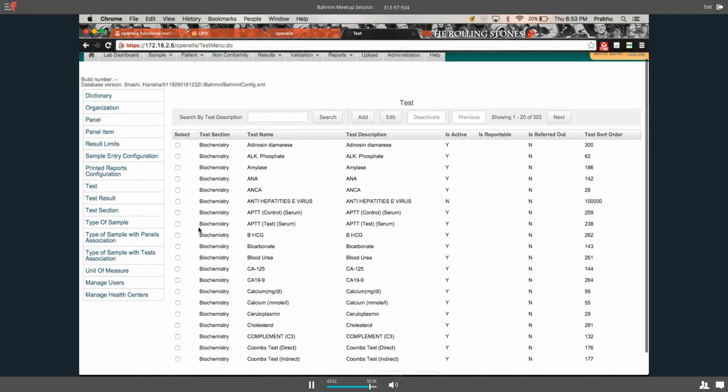And if they know the value is going to be out of range, they could do the dilution to get the right scaling before they did the test, but often they don't. It's one of those things that we actually see in real life, and you want to indicate that it's out of range somehow.